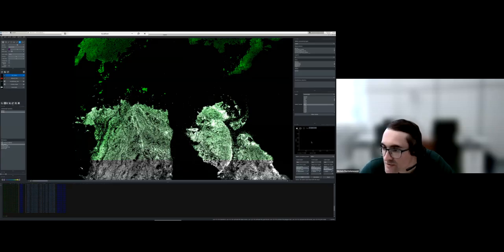Okay, this might take a bit too long to plot. Let's see if it is fast enough. If not, okay, here we are. And maybe I'll try to make this a little bit bigger if I can. Sorry, because sharing the screen is a bit on the small side. But here we have a plot.